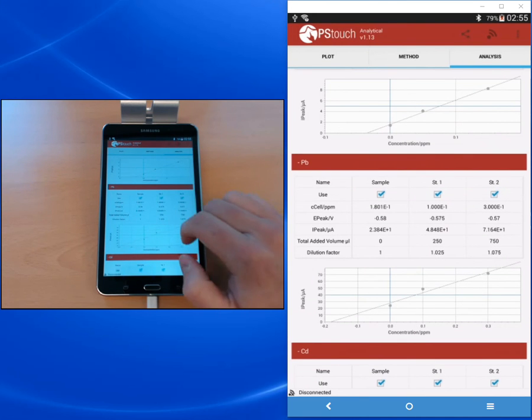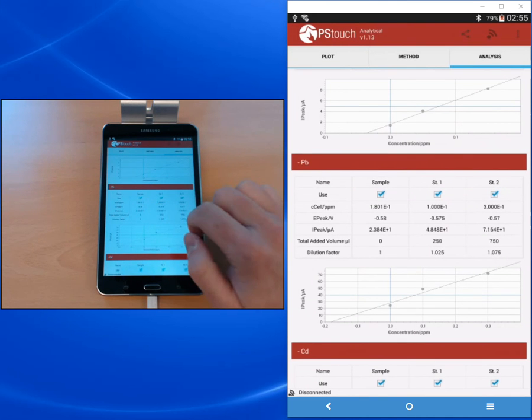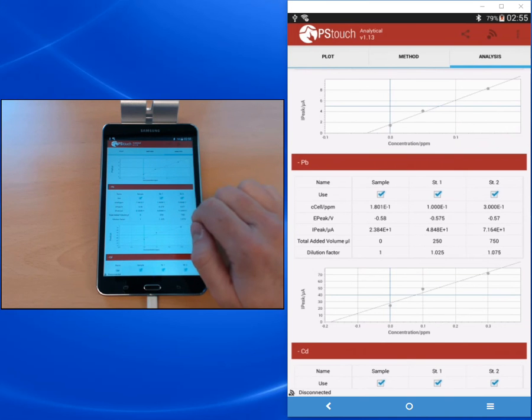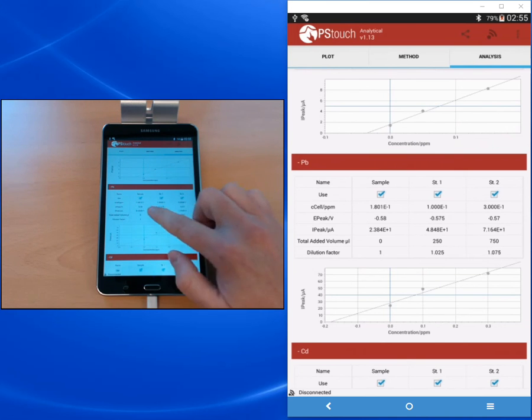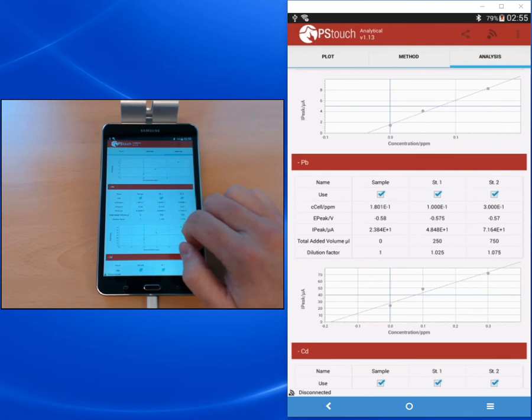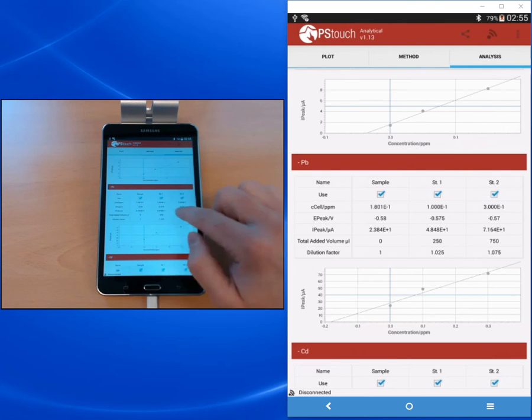You see for each of the points the calculated concentration, the peak potential, the heights of the peak and the added volume, and the dilution factor that's calculated from the volumes that have been added so far.